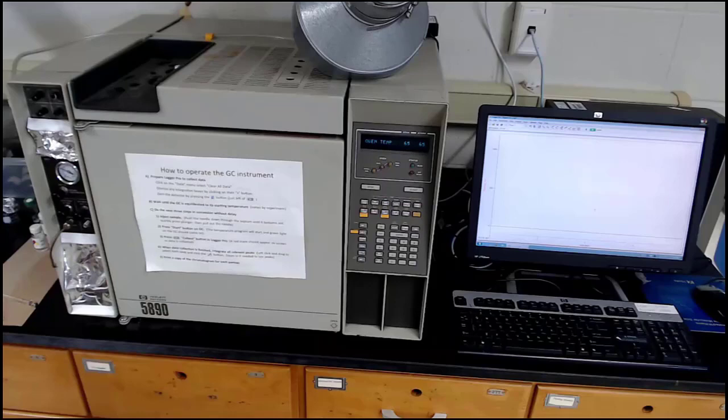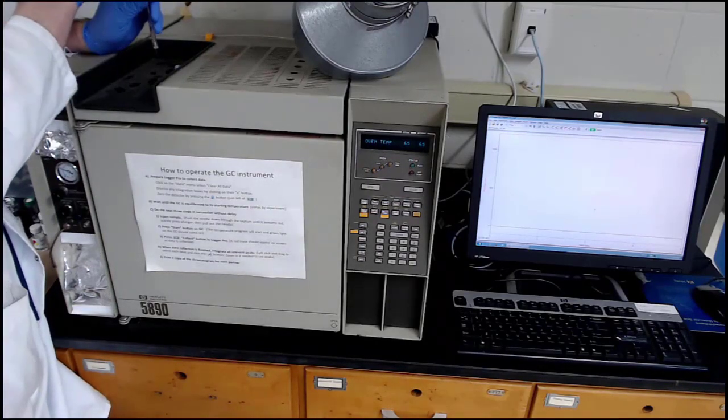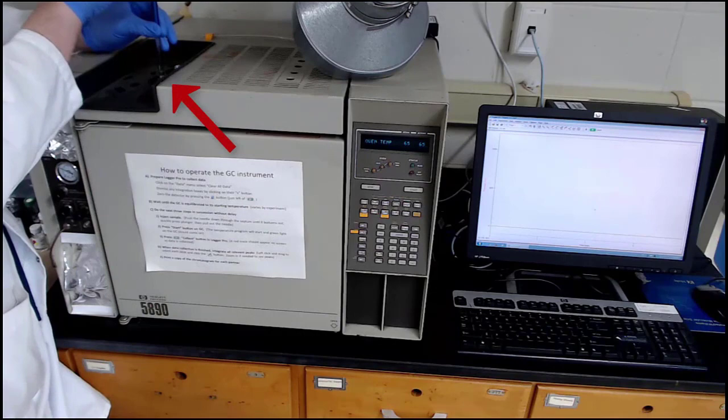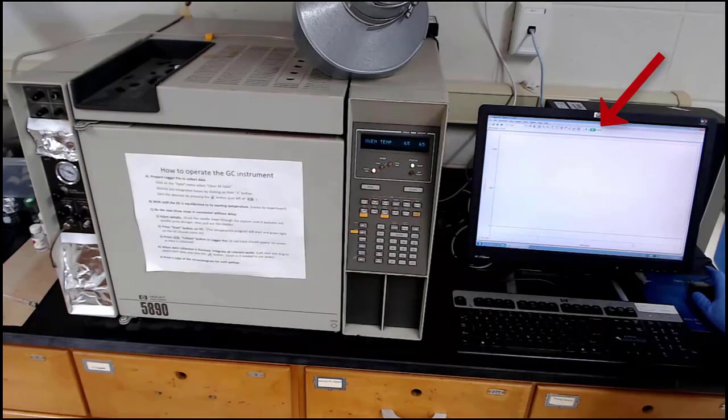The injector port on the GC is on the top of the instrument. Push the needle of the syringe until it bottoms out, then press the plunger down to inject the sample. Press start on the GC instrument, and then press start on the computer on LoggerPro to get the data station collecting data.